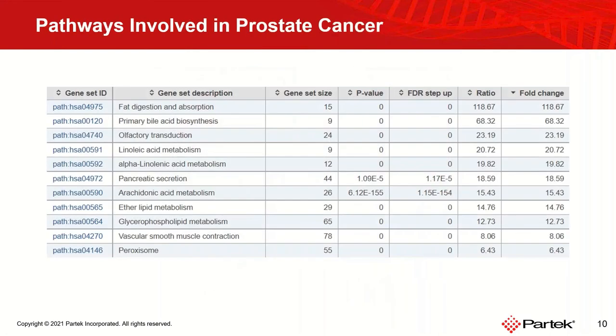My biological question was to find gene pathways that are affected by cancer. To that end, I performed pathway analysis by comparing gene events between the cancer and the normal tissue. Here's the list of the top 10 upregulated pathways, and they are ranked by the fold change. So now it's time to go live, and I will show you how to reach this stage in a step-by-step fashion.